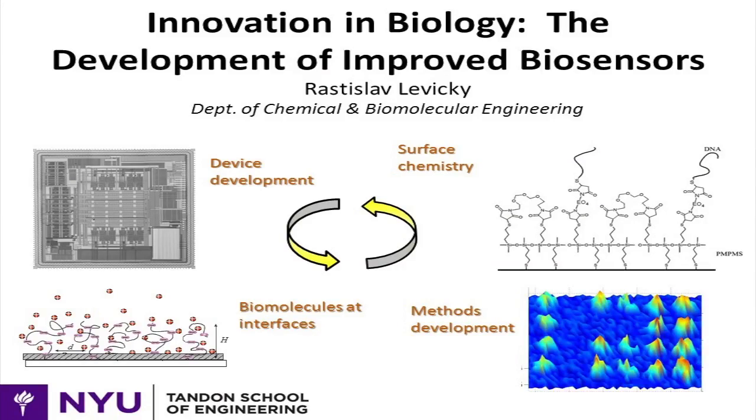We work in the area of, the way I think of it, biointerfacial engineering, and one application is biosensors, and that's what I'll focus on today. Some of the things that attract us to this area are that it combines many skills. Sometimes we have to work with surface chemistry, so you think about how to attach biomolecules to surfaces so you preserve their function and their activity. You want to understand how those molecules organize and some of the thermodynamic and kinetic aspects, some of the physical chemistry aspects of surfaces and biomolecules at surfaces.